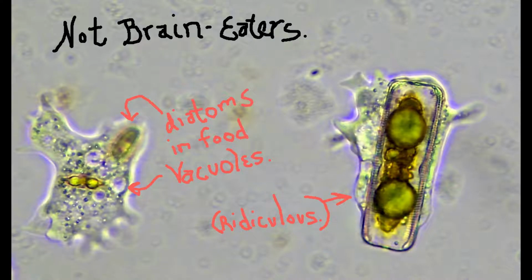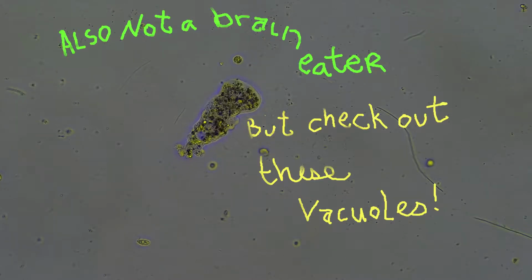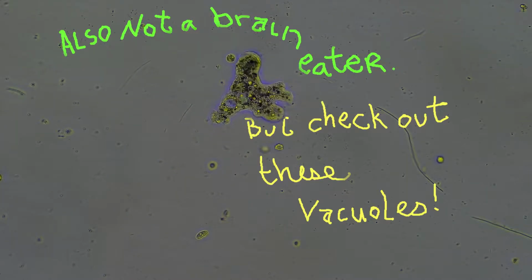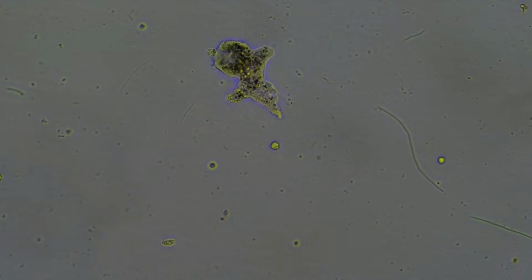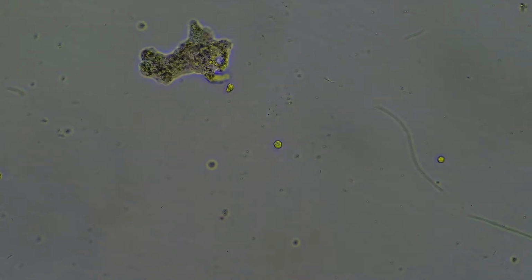That's amoebas when they eat through phagocytosis. They pull things into their body and then they kind of put it into a little vacuole, a little sphere that they dump digestive fluids into, and then they digest it. And you can usually see those things rolling around inside of an amoeba. That could be what we're looking at. Or, you see that little suspicious looking dot? Yeah, I don't know, man. They look very, very suspicious to me.